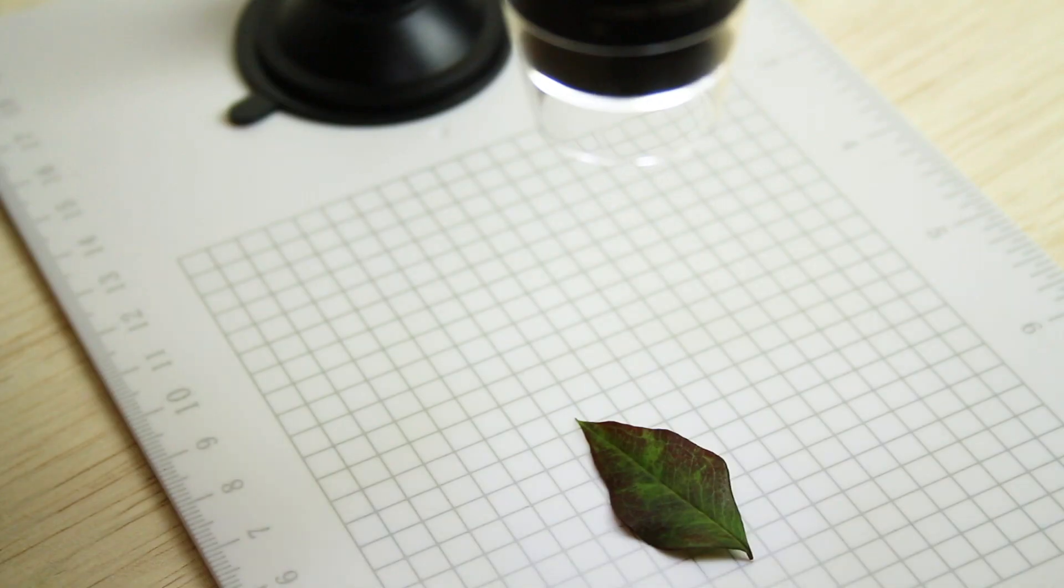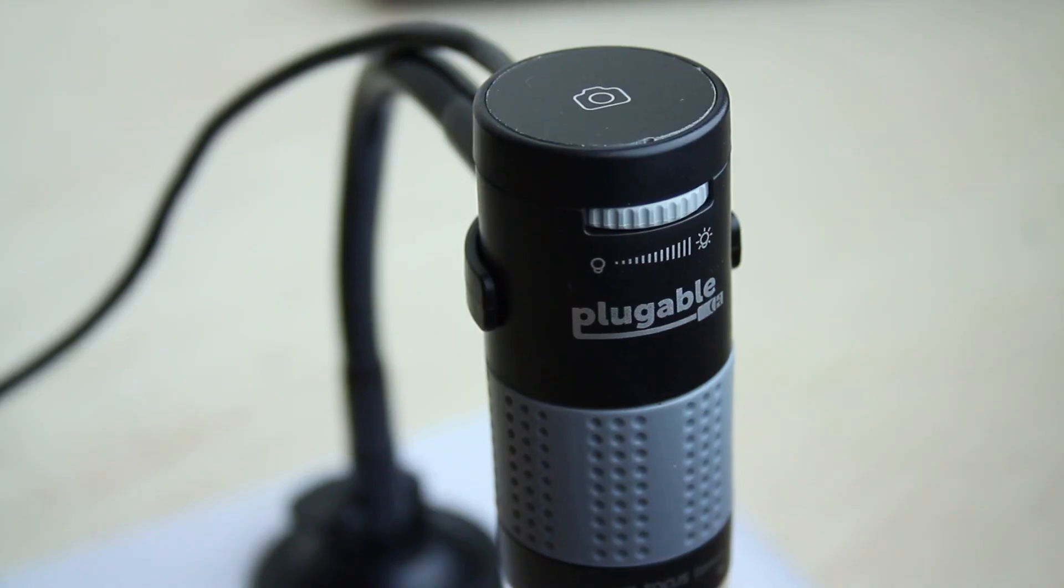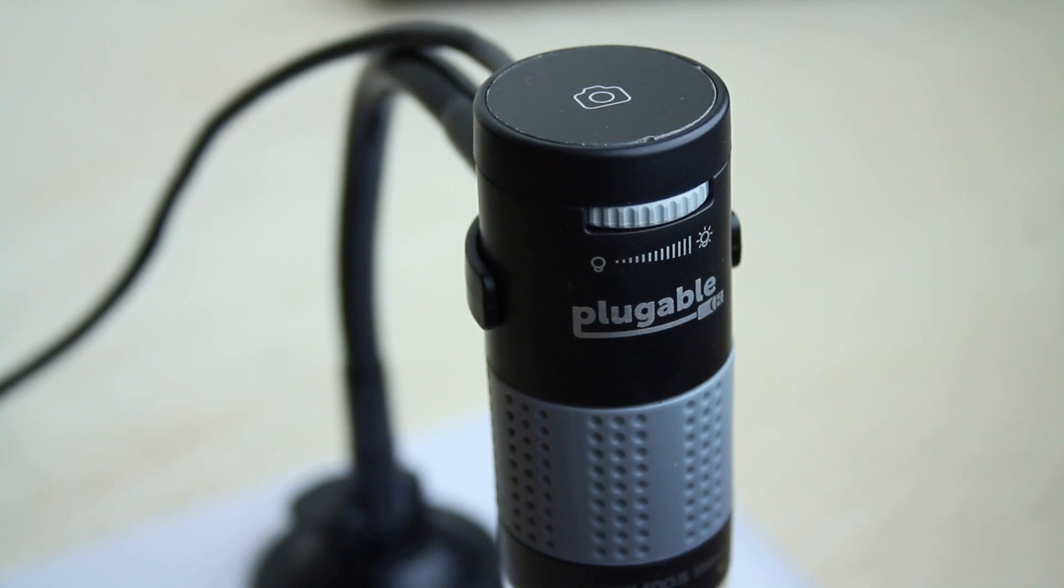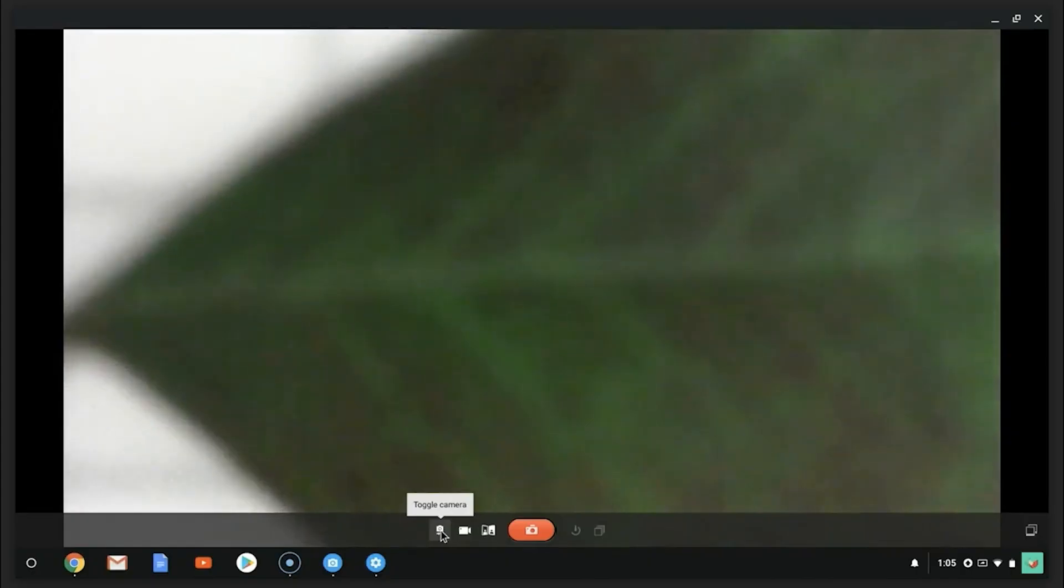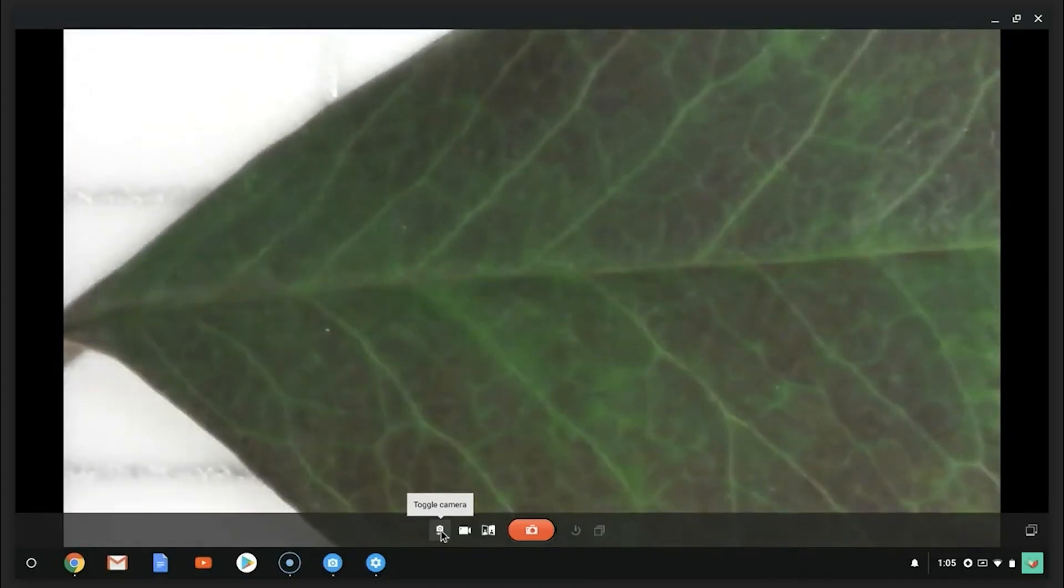You can brighten your image by sliding the grey dial above the lightbulb scale. To focus your image, adjust the grey focus ring.